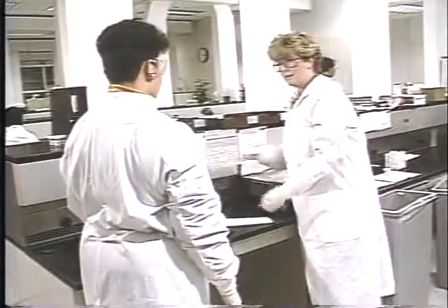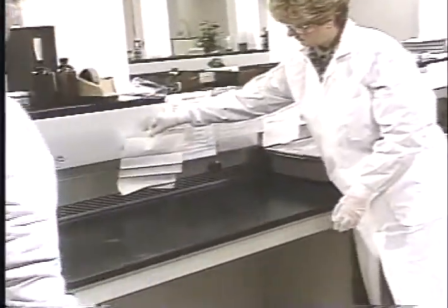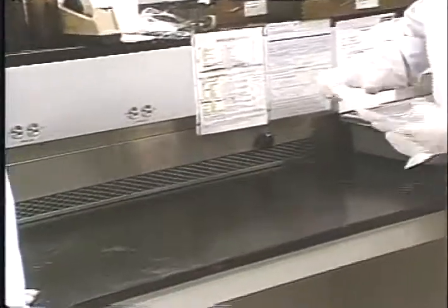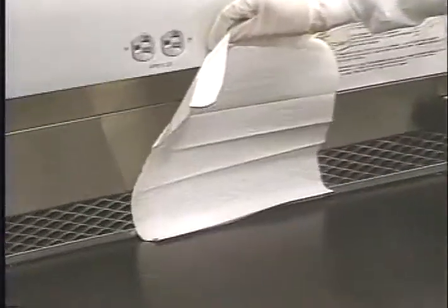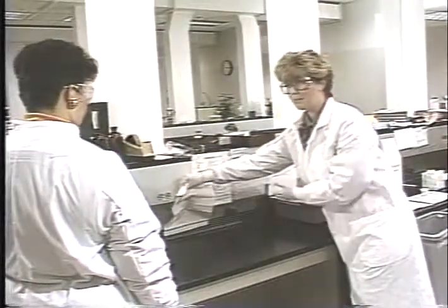As we mentioned before, maintaining proper ventilation is one of the most important safe work practices. Make sure you use lab hoods and other ventilation devices to keep the formaldehyde in the air out of your breathing zone. And follow all the rules for the safe use of these devices.